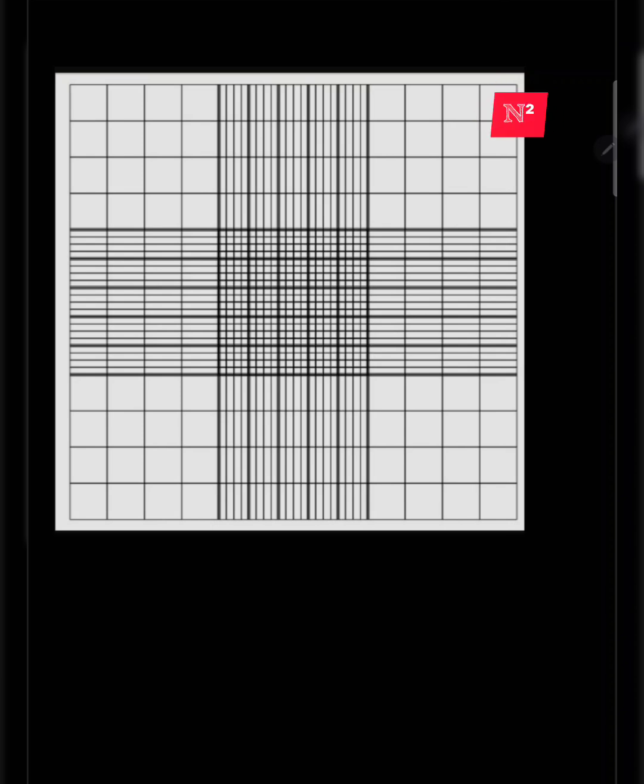Let's learn about the individual parts of the hemocytometer grid with improved Neubauer counting area. These grids are made of some bigger squares, some larger squares, some smaller squares. Each of the squares and areas of the grid is designated for counting the cellular components of the blood, that is the WBC, the white blood cell, RBC, the red blood cell, platelets, and sometimes also sperm counts in special laboratories. So these are the components that we are checking with the help of this hemocytometer slide.